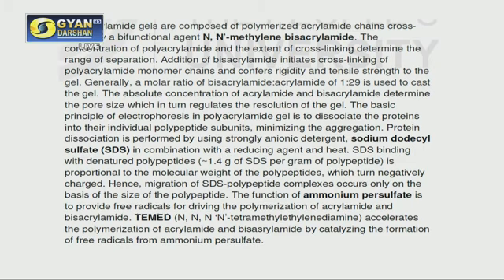We take a quick look at the principle of this experiment. Now for this experiment, what are the components that we need? First is polyacrylamide. Next is bisacrylamide. Now what are the two main functions of this? Like in DNA, we are using agarose as a gel component. Here you are using polyacrylamide and bisacrylamide as gel components.